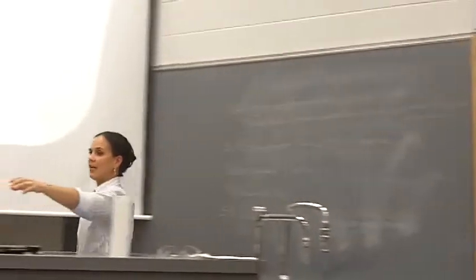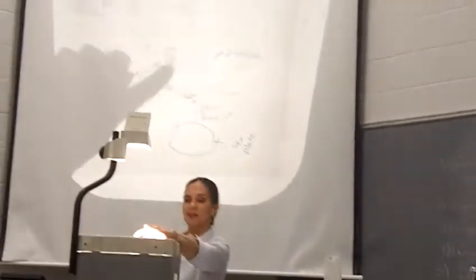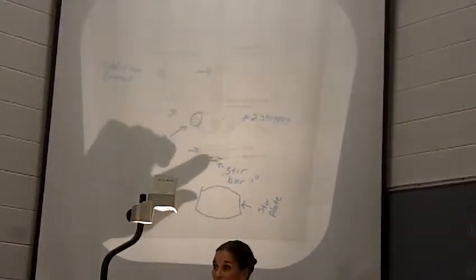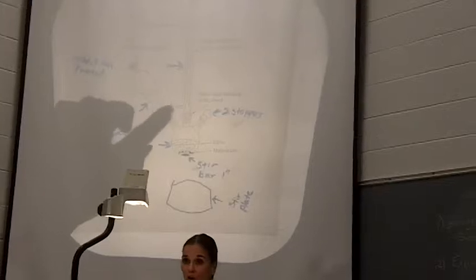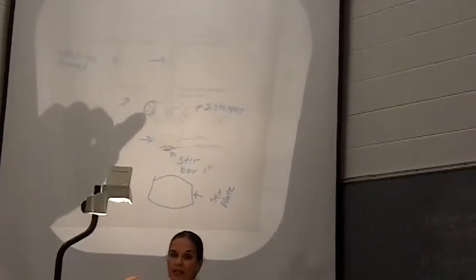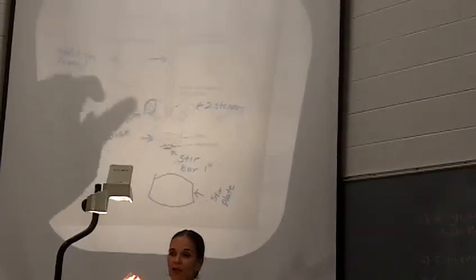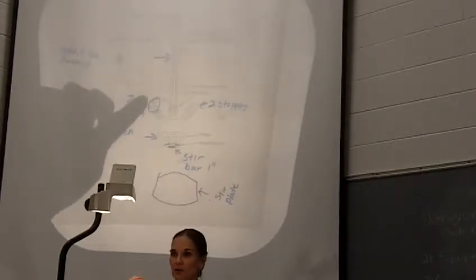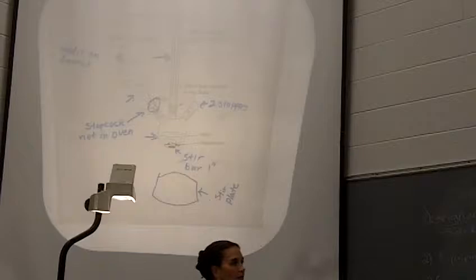You need to be really careful because we just had this open from getting all of our alkyl bromide out, so make sure this is now closed. It's a good idea once you're done adding the alkyl bromide to just close this. And then you're going to add your aldehyde to your separatory funnel, all right? This is going to go in dropwise as well, okay?